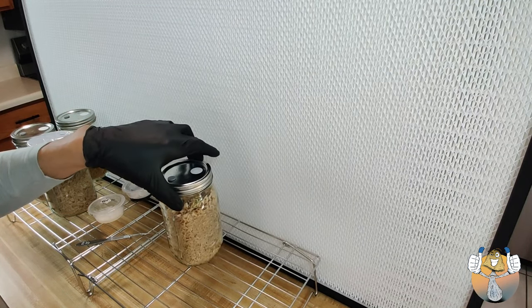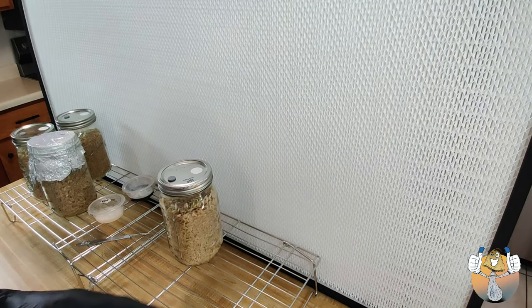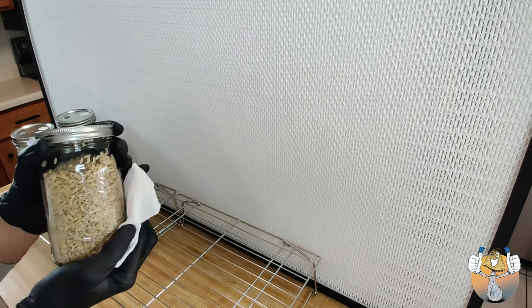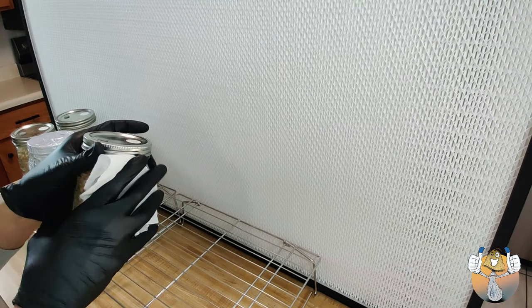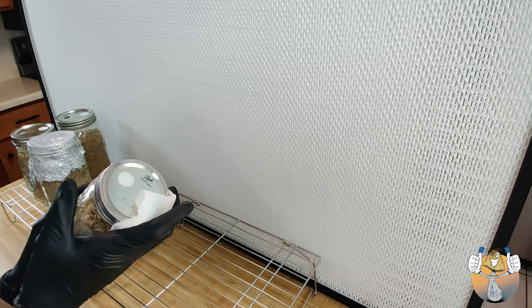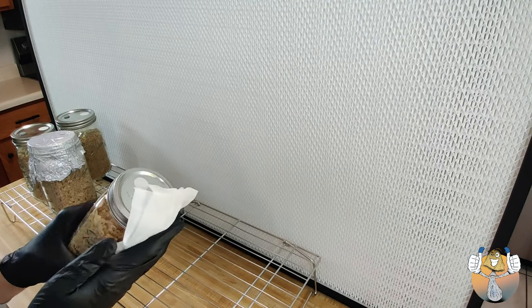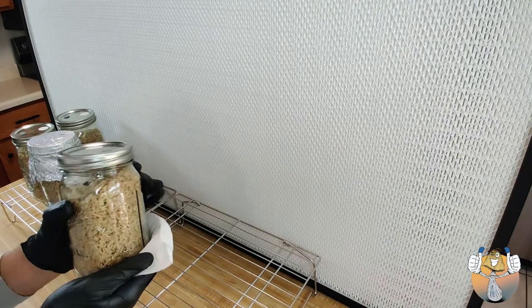So I still prepared my workspace the same way. AC off for about 30 minutes. And after that, I let the flow hood run for about 30 minutes while my jars cooled down. I went and showered, put on some fresh clothes, and we are good to go.